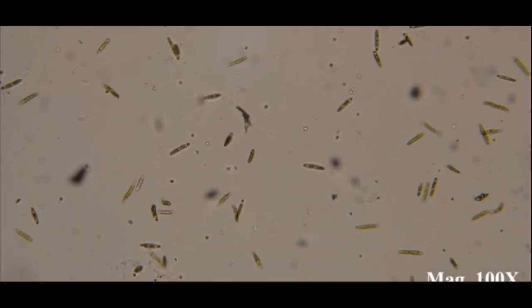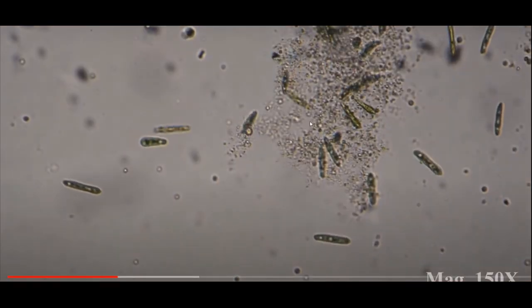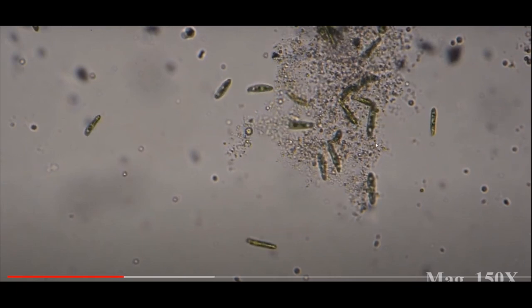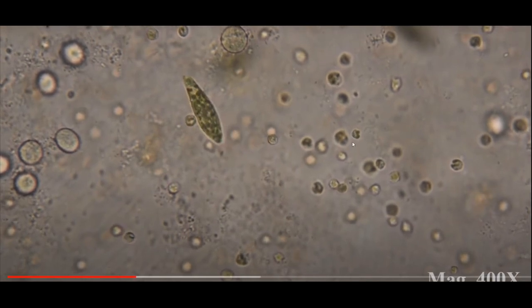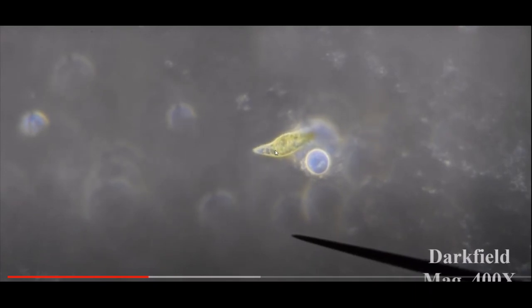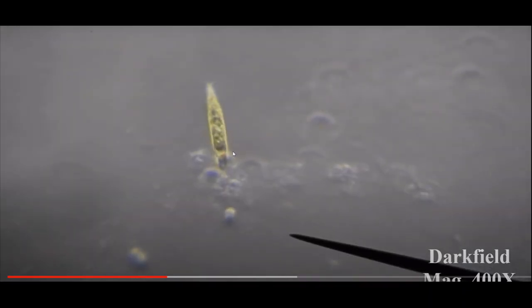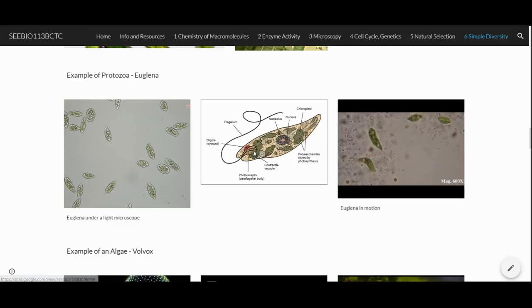Now we have something that we can give them to slow them down, which is more or less what we've got here, where they're basically getting stuck, and then you can watch them more closely. But they're really way more fun to just watch them float around. And on this video, if you're watching it all the way through, you can see the flagellum a little bit here. But there's a couple of other ones where you can see it better. But we'll exit this back out. We'll stop this.